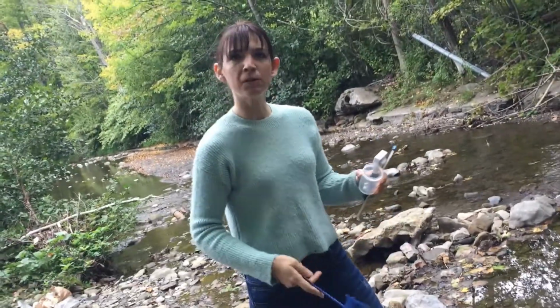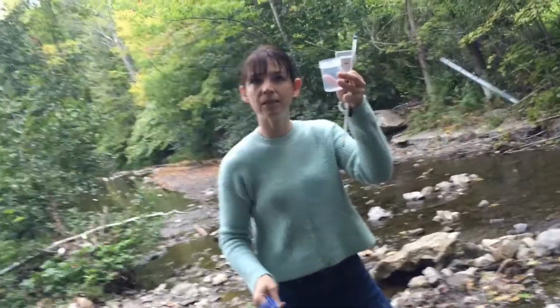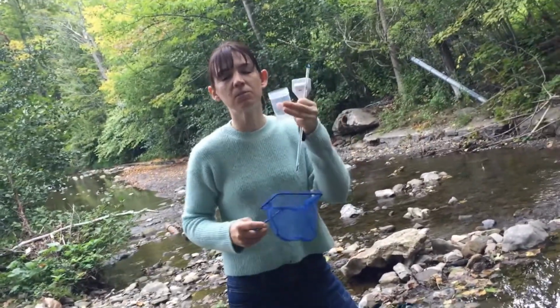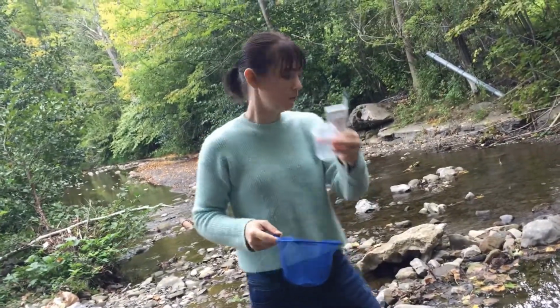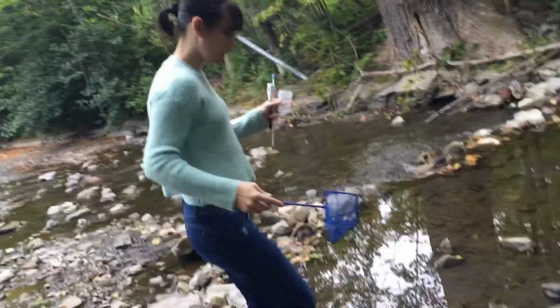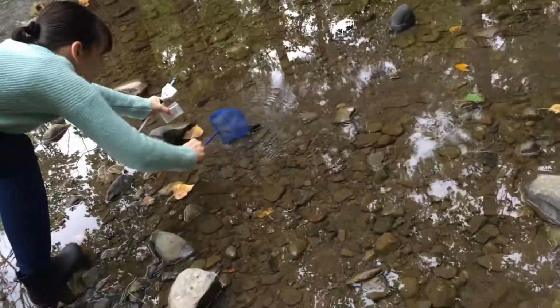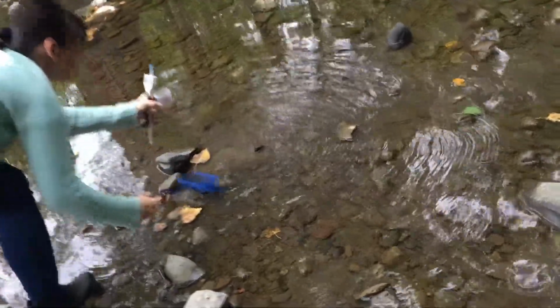So here at test point B, what I'm going to start to do is begin by collecting a water sample, but it's not going to be just water, right? We want to get some of those living organisms in here, the micro and macro organisms. So what I'm going to do is I'm going to come out here and I'm going to kind of scoop some of this in.